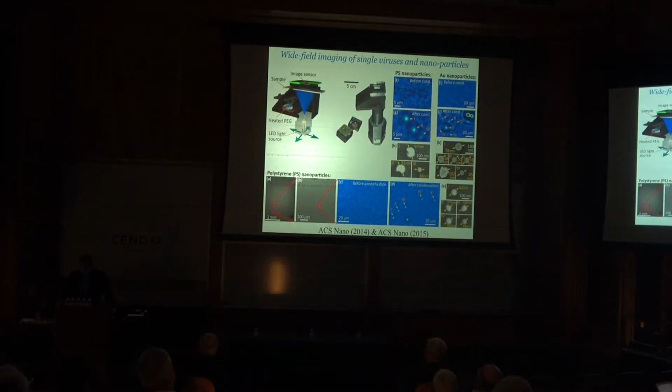So in addition to all the work that we've done on pushing the resolution of this system, we've also pushed the sensitivity of this system so that it can be used as a sensor. In this work that I'm showing here, we're utilizing the same lensless chip-scale computational microscopy platform for looking into individual viruses and nanoparticles. They're tiny. These are 100, 200 nanometer particles, sub-wavelength. That's why it's very difficult to detect them with a bare imaging system. In fact, before we play some tricks, we cannot detect them. It's noise floor as shown here.